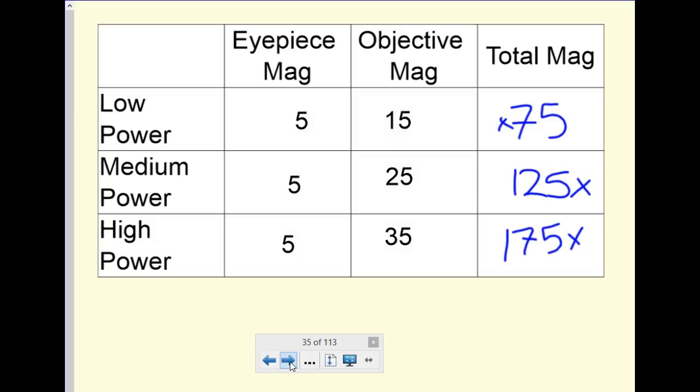Once you've done the sketch or photograph of the skin, then you're going to add a stain to it. Now, it is a biological stain. Its job is to stain, which means if you get any on yourself, it will stain.